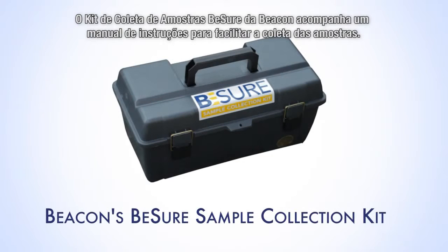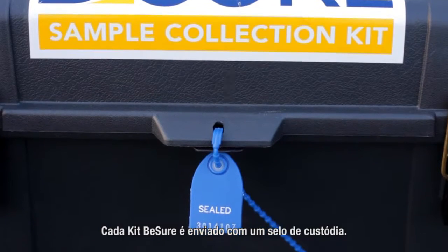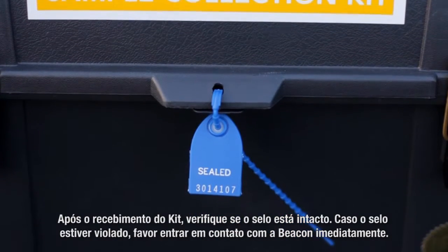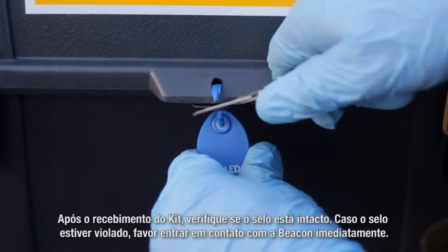Beacon's BeSure Sample Collection Kit is provided with detailed instructions for ease of sample collection. Each BeSure kit is shipped with a tug-tight custody seal. When the kit is received, verify that the seal is intact. If not, contact Beacon immediately.